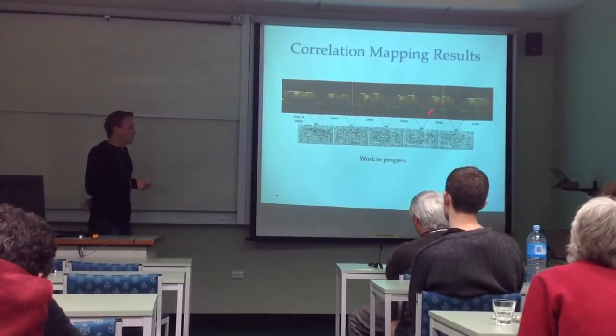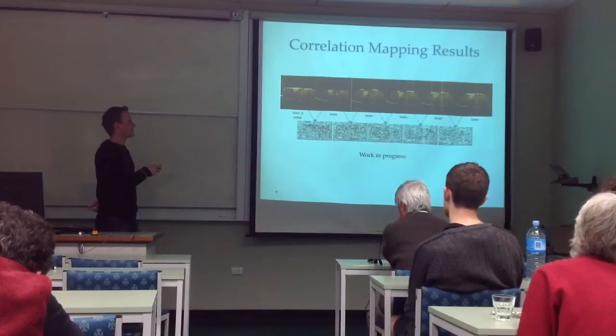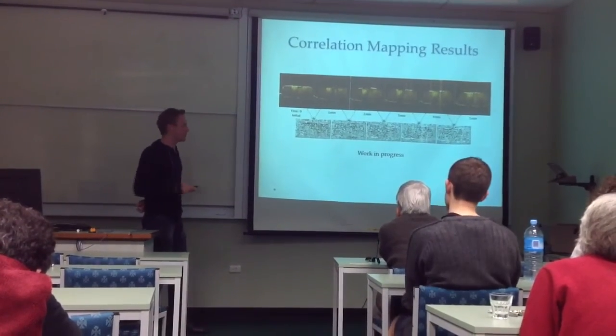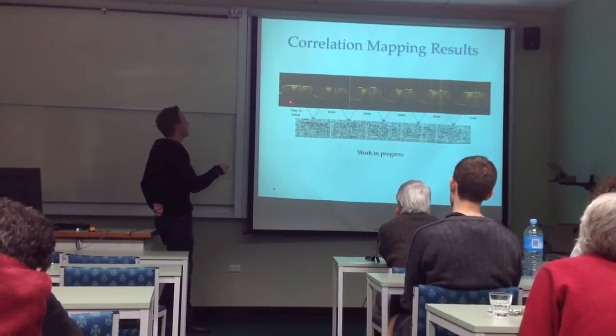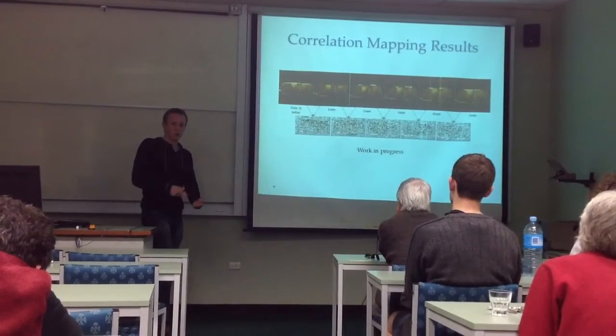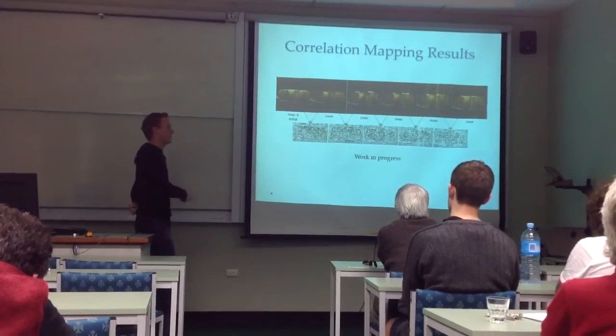We're currently working on developing the cross-correlation code for the solution diffusing through the tissue. So here's a slight preview. This is the time 0 image, and I take further images, actual full 3D scans, a minute after each previous one.